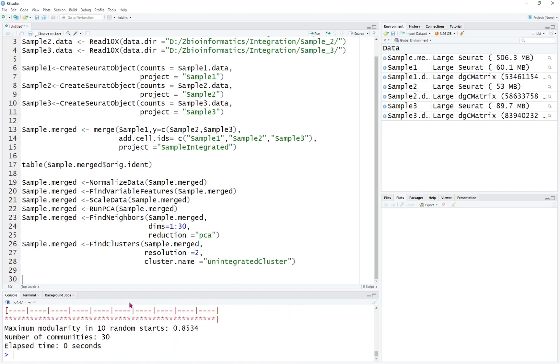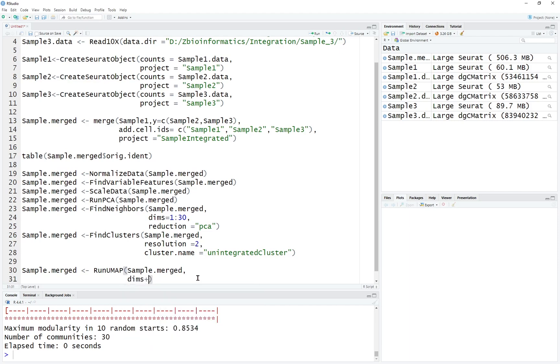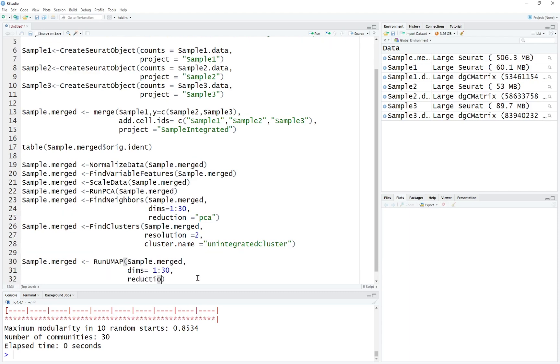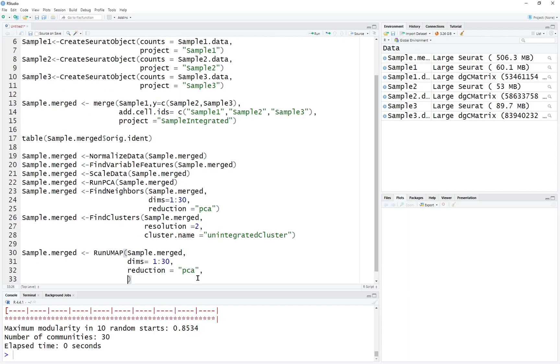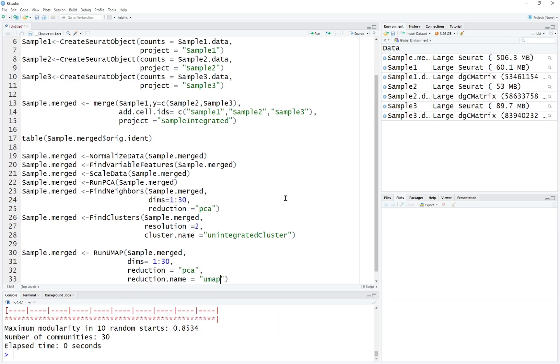We can run UMAP and show the dimensional cluster map. RunUMAP will be on sample merged. The input is always the same sample merged — we keep processing the same Seurat object. The dimensions are 1 to 30, reduction will be PCA, and the reduction name we can give will be UMAP — let's call it unintegrated UMAP.